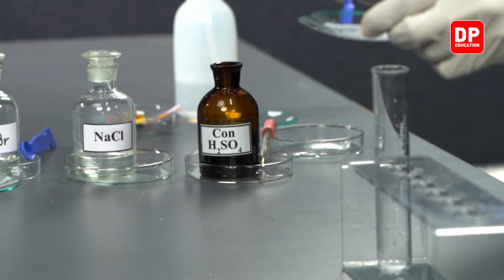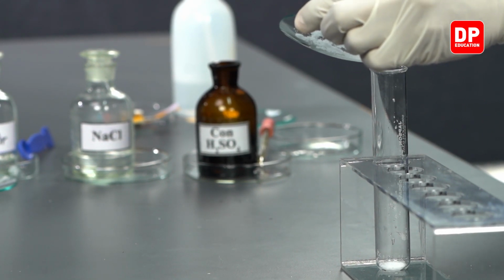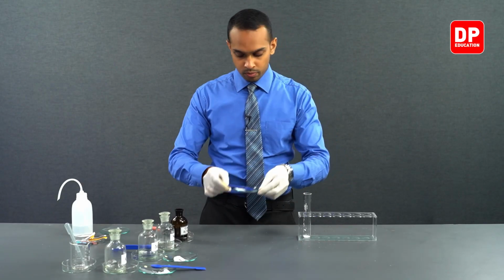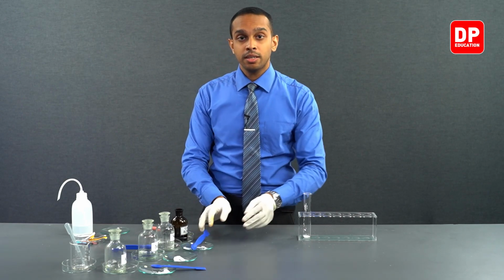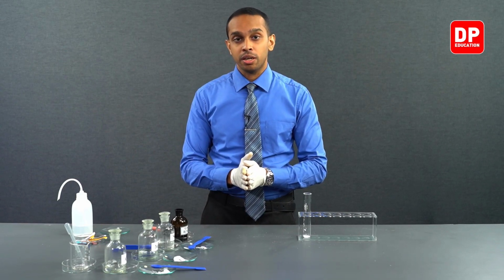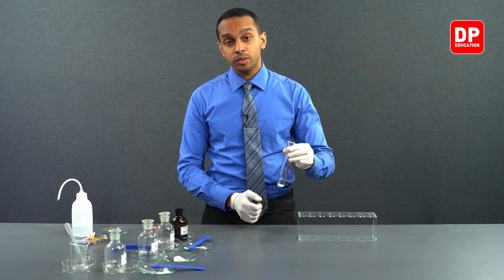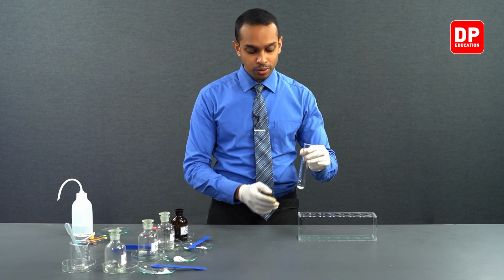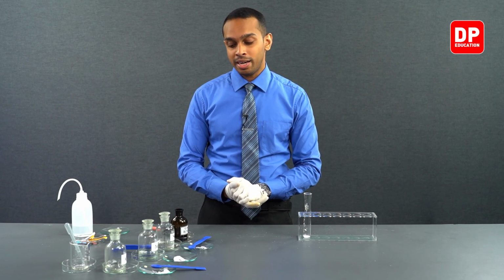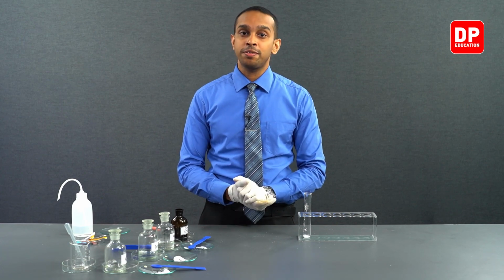It will be easier to add it like this at times. And before I add sulfuric acid, I would like to mention the reaction that is happening here. Once you add concentrated sulfuric acid onto sodium chloride, the chloride ions will not convert into chlorine gas. Instead, it will form HCl gas that appears as a misty fume.